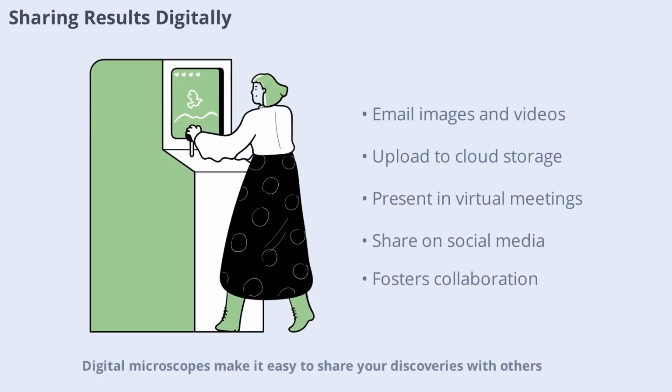Digital microscopes make it easy to share your discoveries with others. You can email images, upload videos to cloud storage, or present findings in virtual meetings. Some microscope software even offers direct sharing to social media or collaboration platforms. This connectivity is especially valuable for remote learning, team projects, or professional presentations. Sharing your results helps foster collaboration, receive feedback, and inspire curiosity in others.